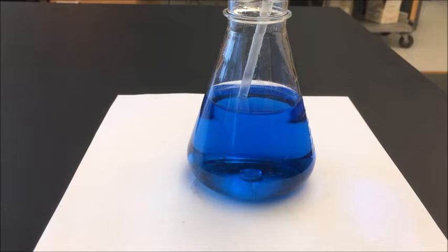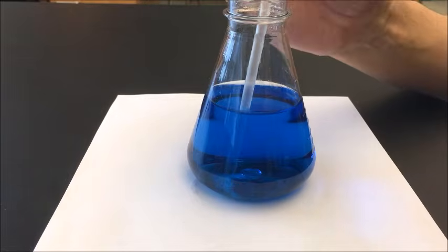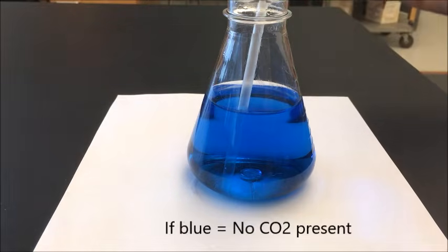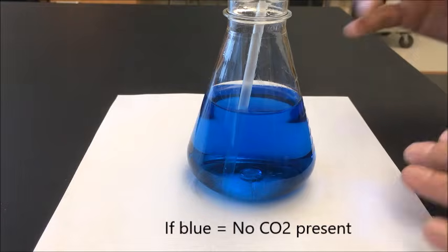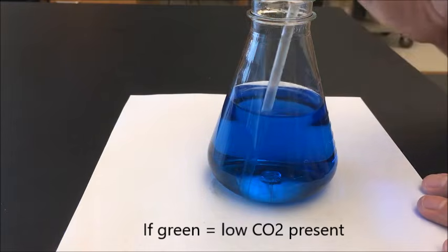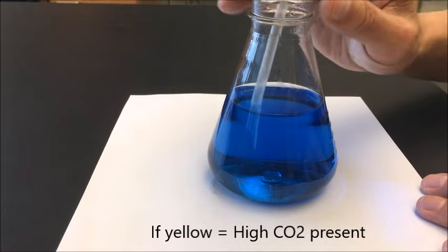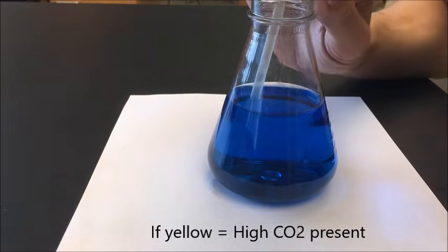So after a little bit of time, the carbon dioxide will build up, which is an acid, and the bromothymol blue will start to turn color. At first, it might turn to a greenish color. If it's blue, like right now, that means there's no carbon dioxide really in the flask. If it turns a green color, that means there's a little bit of carbon dioxide. And if it goes yellow, that means there's a lot. So I'm going to start blowing my breath right now.